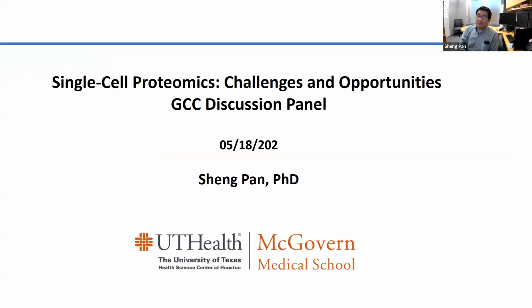So Julia just gave a fantastic overview on single cell proteomics, especially the target analytical techniques, and also the opportunities and challenges for applying single cell proteomics for research. So I have a few slides that I would like to talk about mass spectrometry-based single-cell proteomics for global profiling of single-cell proteome.